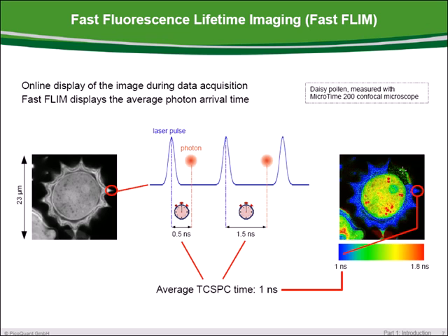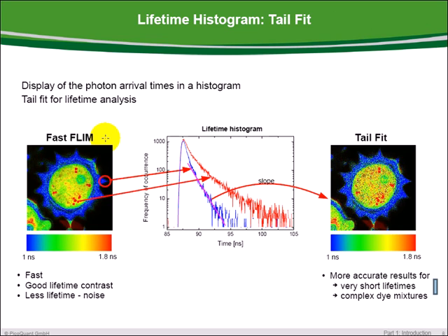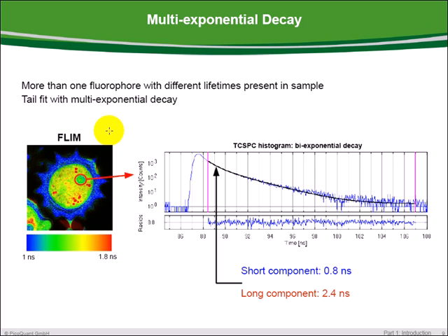We observe in this sample of a daisy pollen that autofluorescence can deliver strong lifetime contrast. Comparing this fast FLIM analysis with a single exponential tail-fitting procedure, we observe that the tail-fit FLIM image exhibits more noise in its lifetime display; however, the obtained lifetimes are comparable. The tail-fit delivers more accurate results for very short lifetimes and complex dye mixtures. Analyzing a certain region of this daisy pollen, we find in the TCSPC histogram a bi-exponential decay exhibiting two lifetimes of 0.8 and 2.4 nanoseconds.